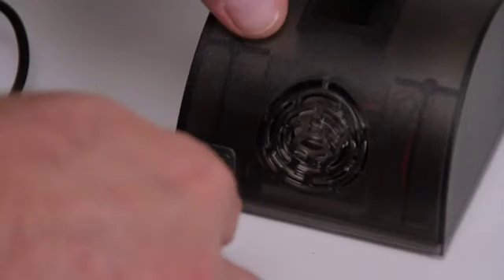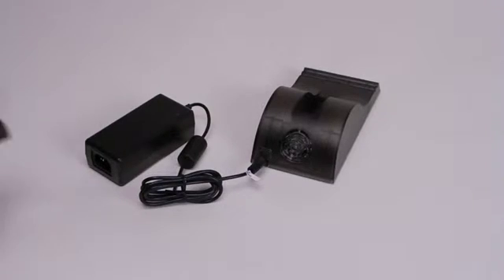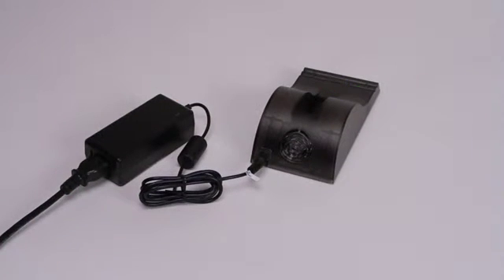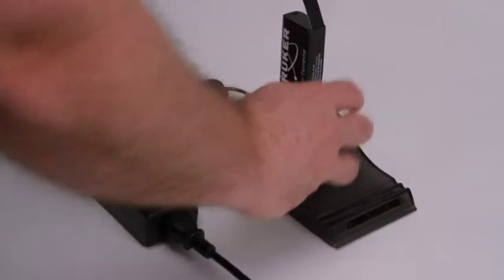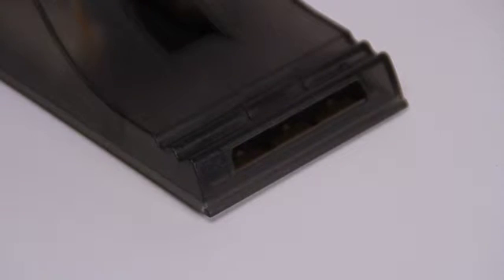To operate the battery charger, plug the DC connector from the power supply into the back of the charger. Connect the power supply to the mains AC supply using the cable provided. Insert the battery into the charger. While the battery is charging, the charger indicator LED will flash green. When the battery is fully charged, the charger indicator LED will be a solid green.